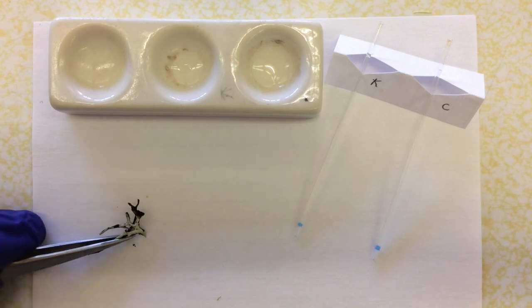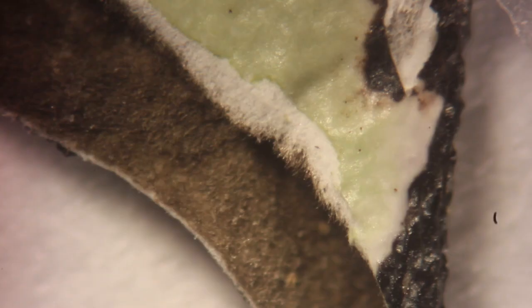Let's see that reaction up close. In this reaction, we also get an initial K plus Y reaction on the cortex. This one's a lot more subtle than the previous one, and you can see a quick flash of yellow on the cortex, which eventually fades into a sort of green color.